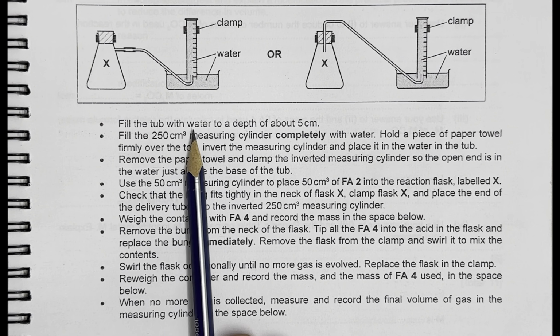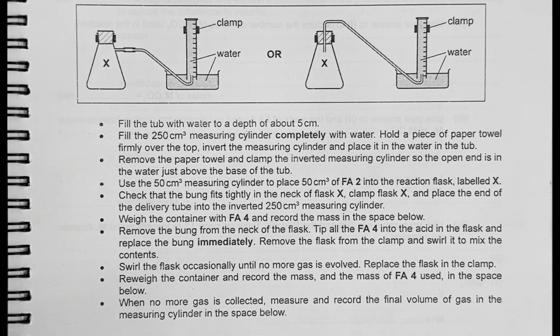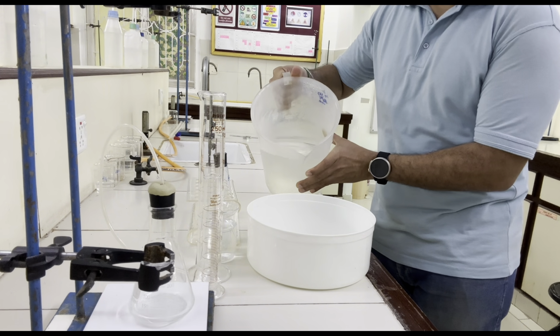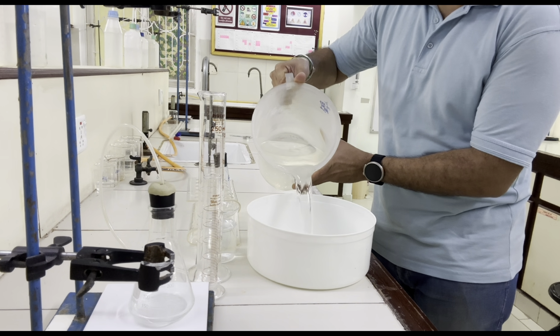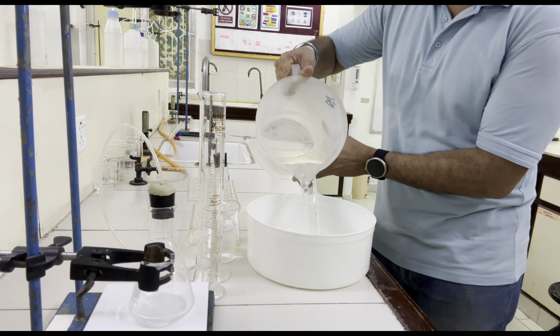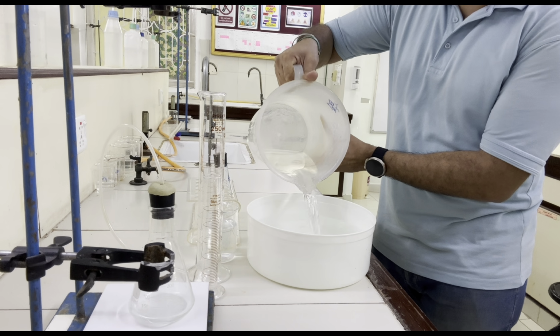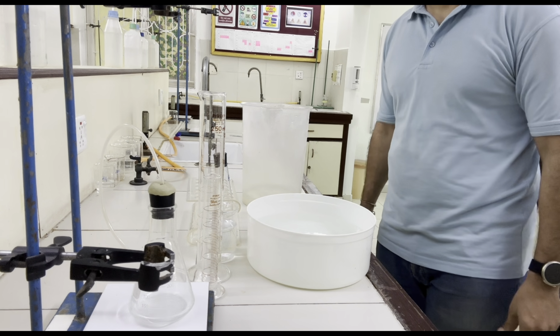Fill the tub with water to a depth of about 5 centimeter. Now let's take distilled water up to 5 centimeter depth in this water tub.